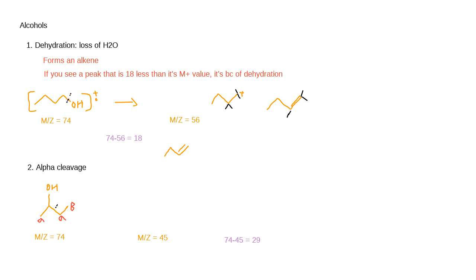Okay, so once again, we're cleaving right here, and what you're left with is something that looks like this.